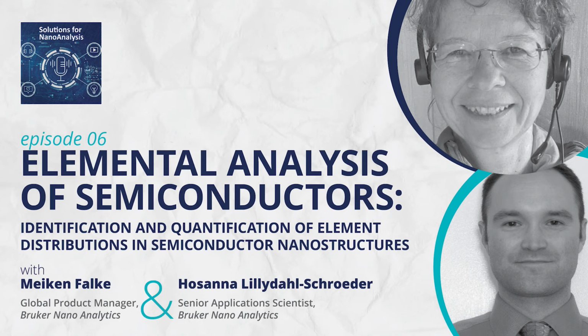Yeah, that probably explains a couple of papers that I discussed with a customer doing battery research some time ago, saying they'd seen some very, let's call them creative, diagrams showing excessive amounts of elements being deconvolved from an EELS spectrum. So that's a problem in any technique, I think.